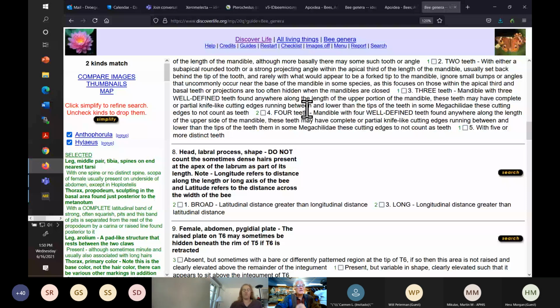And that's all I'm going to say. So please, anyone else who has experience with specimen preparation that involves pinning and spreading and pulling genitalia, please put some comments into the chat for folks, because I'm a poor representative of doing that. Genitalia, same way. You grab a hooked pin and go in there, and you're able to pull out the genitalia. That's all I know.